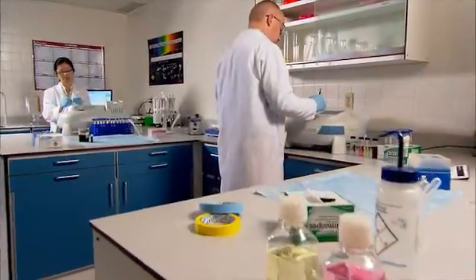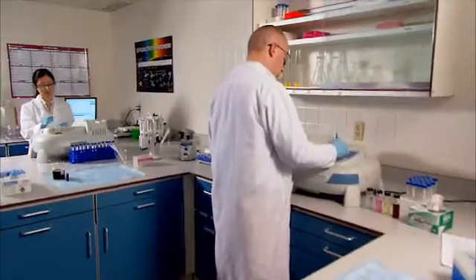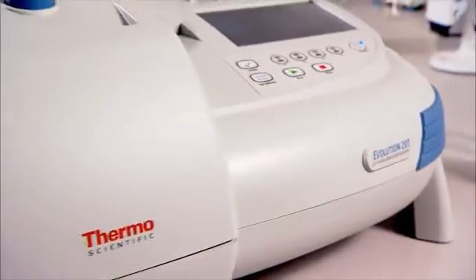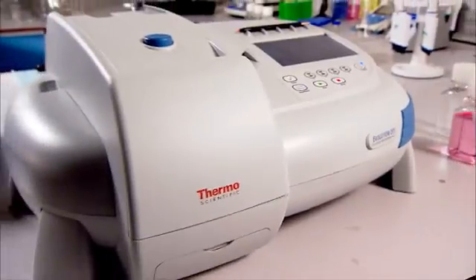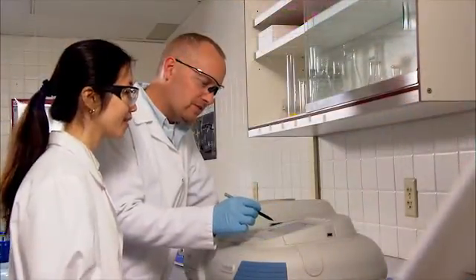The Thermo Scientific Evolution 200 series and Q software. The most technically sophisticated, accurate, and easy-to-use UV visible spectrophotometers. Your results speak for themselves.